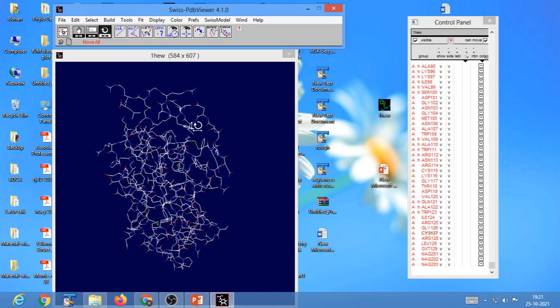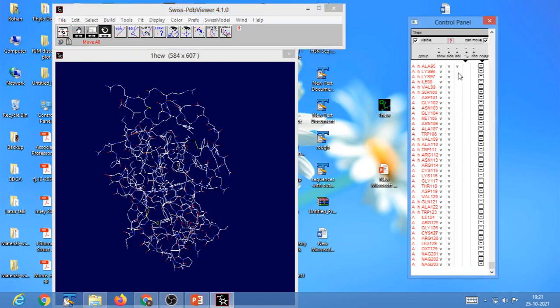Whatever measurements you yourself make are called user labels. This is meant to distinguish user labels from the group labels that you usually put forth by using the Label menu from your control panel. This is different from what you do here, so whatever you do would be included in user labels.